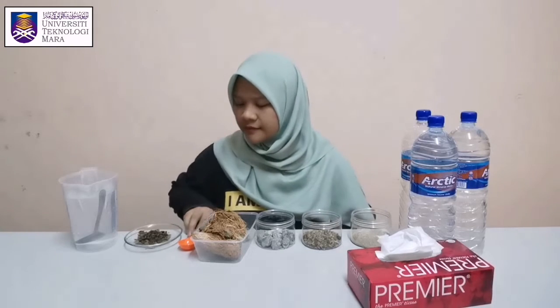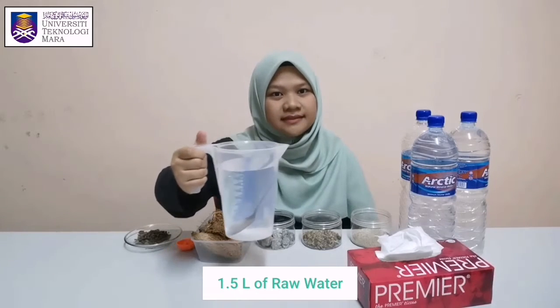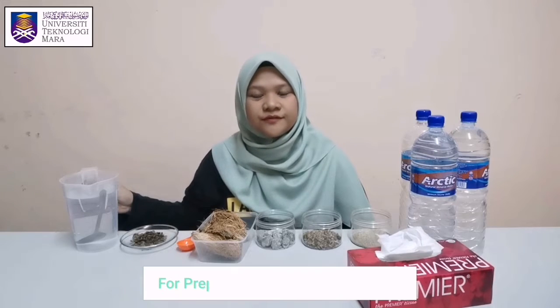All the materials and apparatus are to be known before starting the experiment. First is the tablespoon, 1.5 liter of raw water, and the soil. These three materials and apparatus are used for preparation of synthetic raw water.